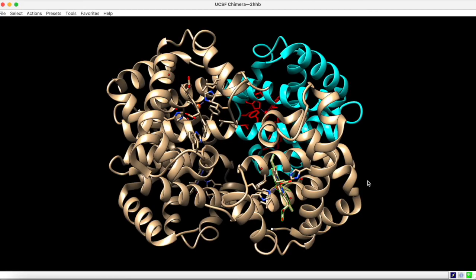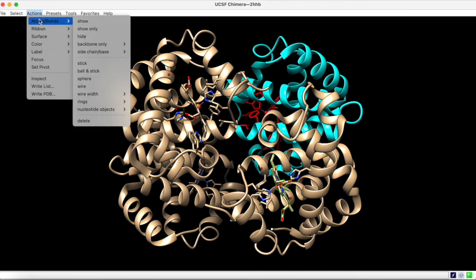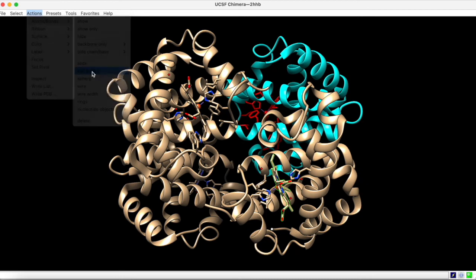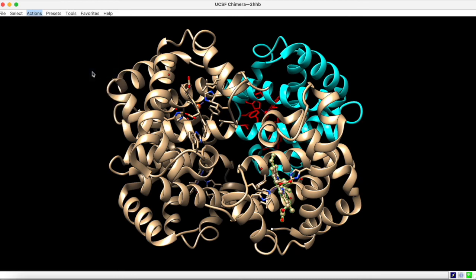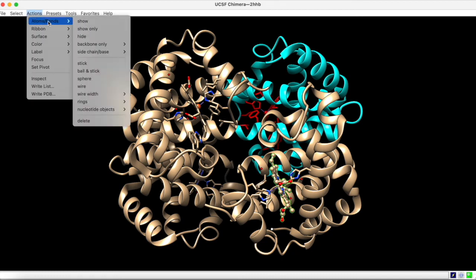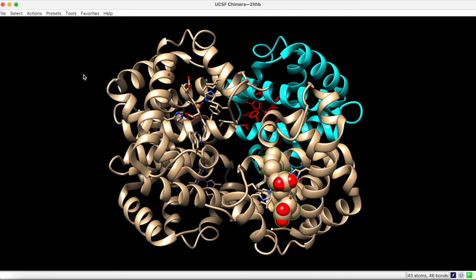You can also use actions in Chimera to toggle structural representation as well as coloration. Like before, I've used intersect to select the heme group associated with chain B. Under Actions, Atoms, and Bonds, we can toggle the representation. For example, choosing ball and stick will change the representation as shown here. If we want a more space-filling model, we can choose sphere.